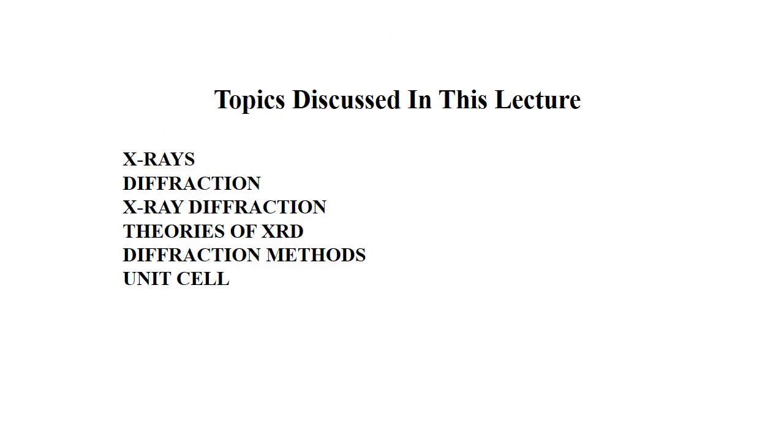In this lecture, inshallah, we will discuss the X-rays, the diffraction, the X-ray diffraction technique, the theories which are involved in the X-ray diffraction technique, the methods of diffraction, and at the end the unit cell.